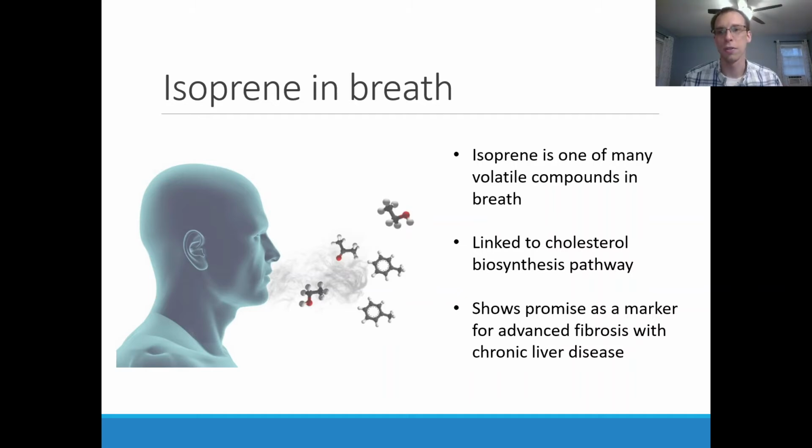So these are some of the reasons why it's important to be able to measure concentrations of isoprene at very low levels, because in both the atmosphere and in breath, isoprene is present in the part per billion range. And so we, in our lab at Connecticut College, are working on developing an infrared spectrometer that can measure these low concentrations of isoprene. And that's the work we're presenting here. There are other ways to measure isoprene, for example, mass spectrometry, and this is a complementary technique to those other methods that already exist.